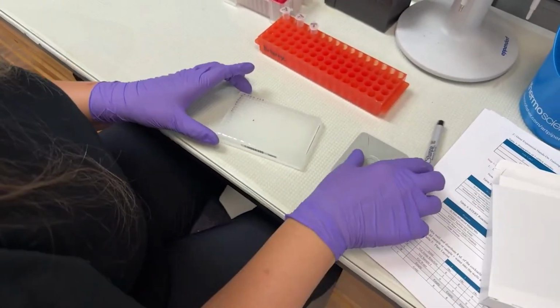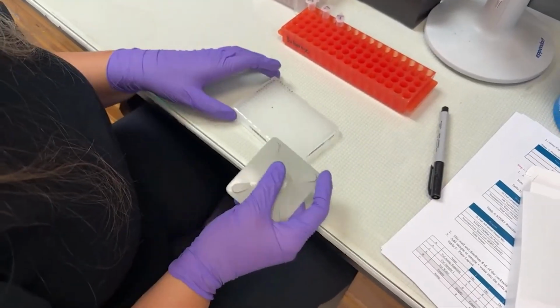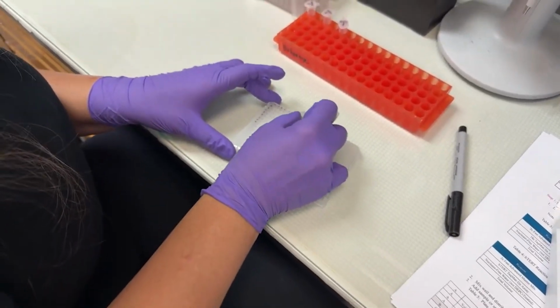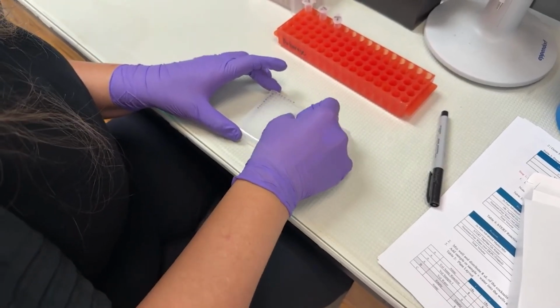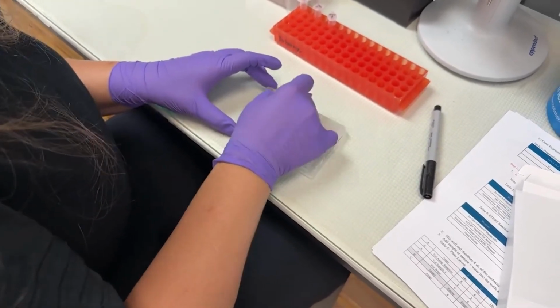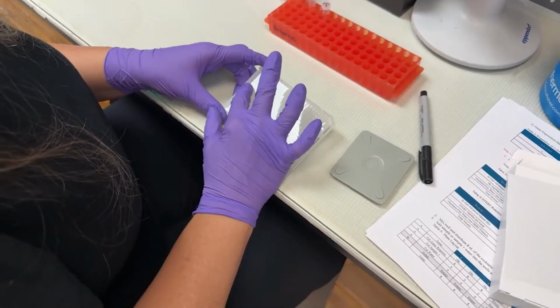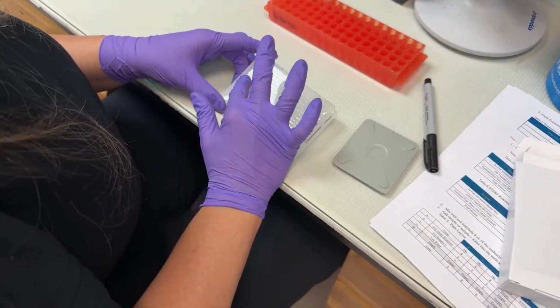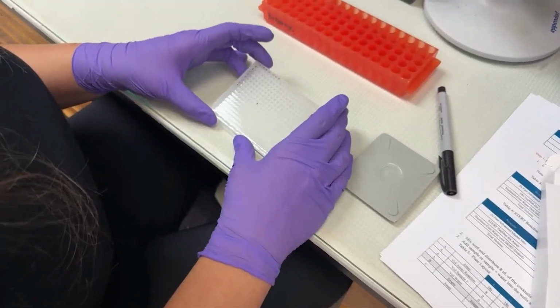Okay. Now what I want to do is double check that I actually have a good seal. So I'm just going to go back over the locations that have samples in them. Give them a good press. And sometimes I'll even take a gloved hand and run my finger over those just to double check that that seal's completed.